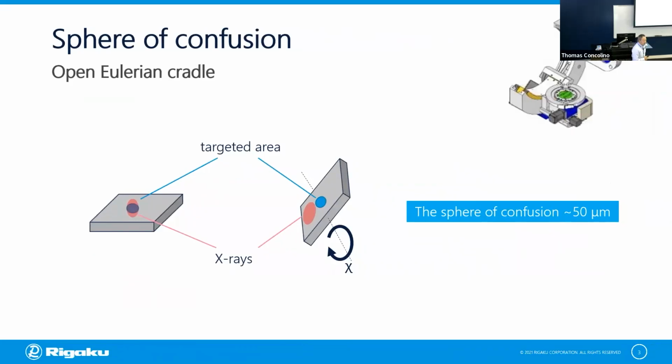One application is residual stress measurement. I remember the Professor this morning also discussed how we measure residual stress by X-ray diffraction. One of the different methods is called the side inclination method, where we do a sample tilt, that is, incline your sample towards the incoming X-ray beam.